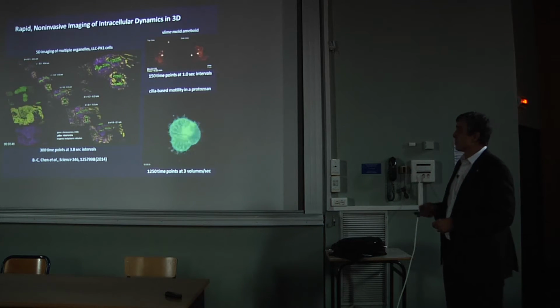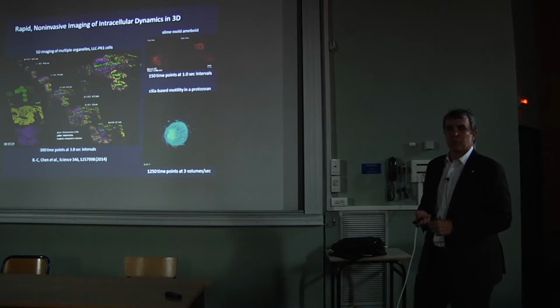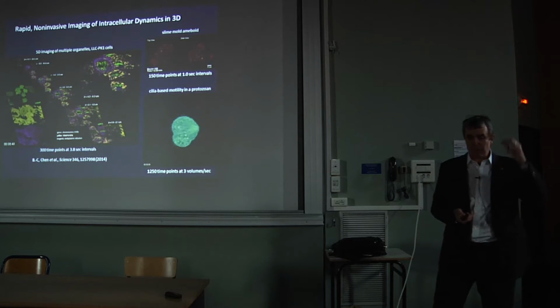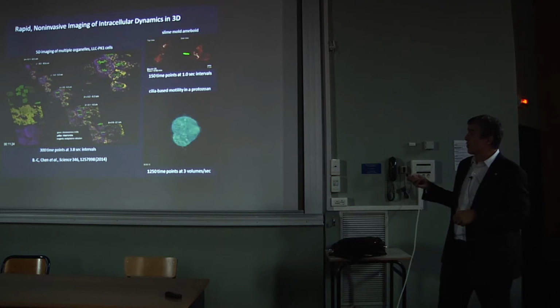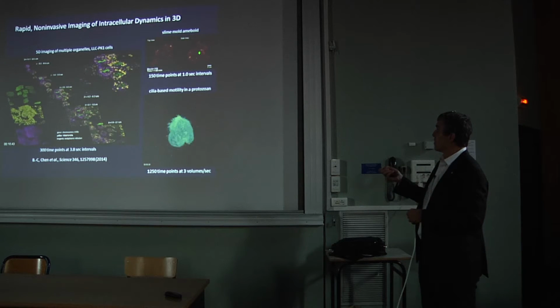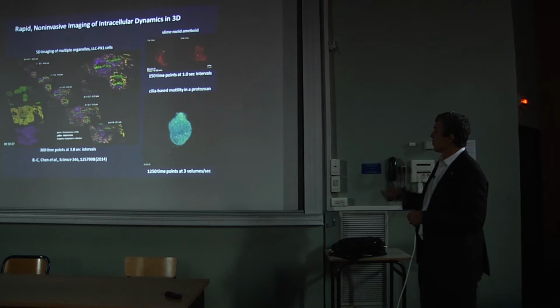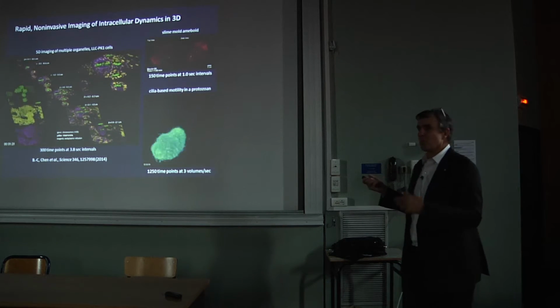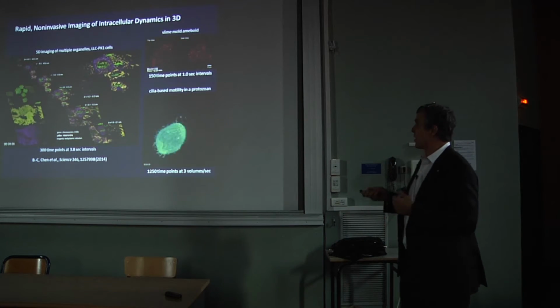Here's another example of looking at a slime mold amoeboid, which is a model organism called Dictyostelium. And again, these are very light sensitive. What you can see when the movie wraps around is that there's a strange little lightning bolt. When we first saw that with our collaborators, they go, what the fuck was that? You know, why are you asking us? We're not biologists, I don't know.